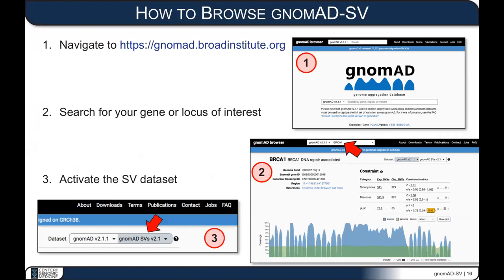Now for some specifics — a basic 101 on how to access, browse, and use the gnomAD SV dataset. First, go to the gnomAD website at gnomad.broadinstitute.org and search for your gene or locus of interest. The most important part is you need to activate the structural variant dataset by going to the top right of the screen and clicking on the 'gnomAD SVs' button. This toggle activates the SV dataset and deactivates the SNVs, switching you to a browser view of structural variants rather than sequence variants — a lot of people get tripped up on this.